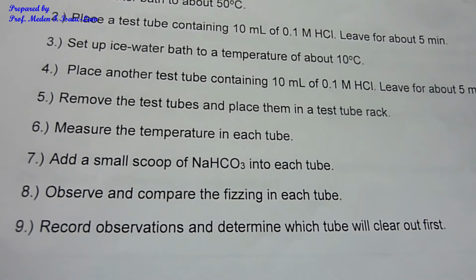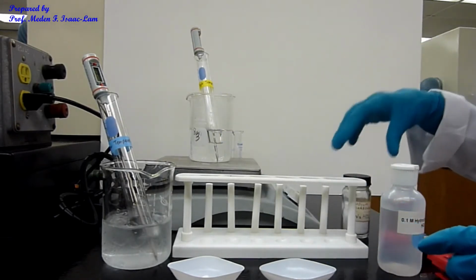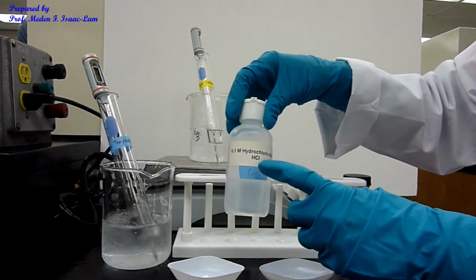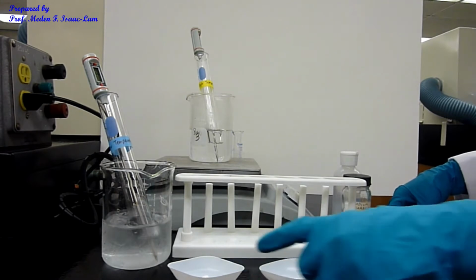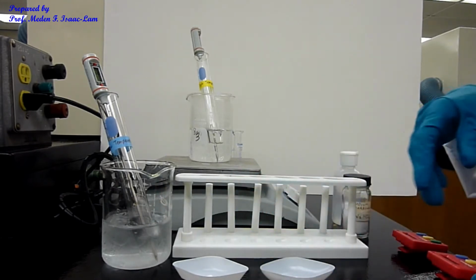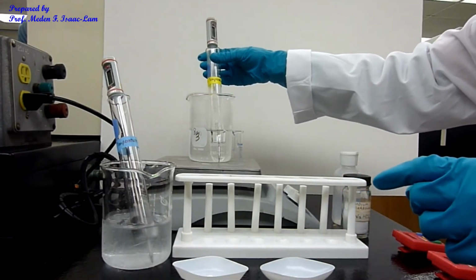Again, we're going to time it. I have the sodium bicarbonate, NaHCO3, and I also have the hydrochloric acid, 0.1 molar. And I also have a small amount of sodium bicarbonate in the weighing boat. And then I have in here the low temperature. And then I have this on the hot plate.